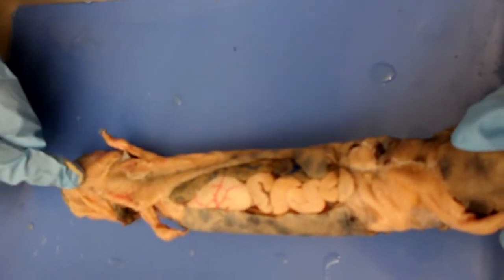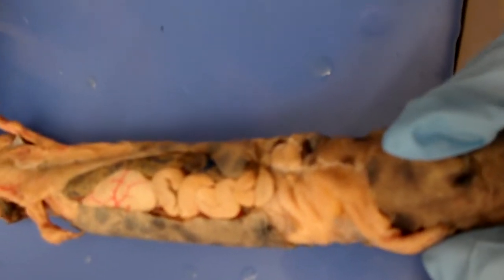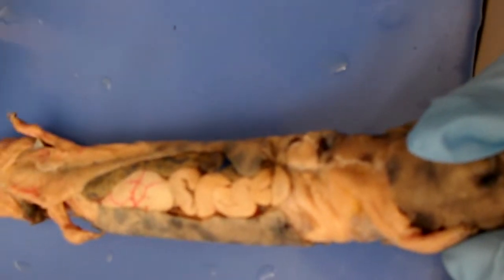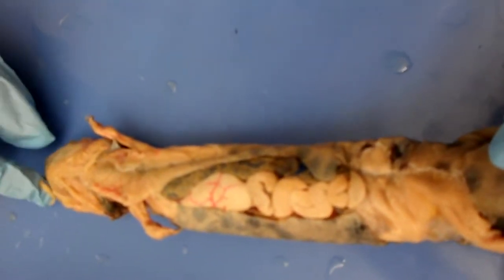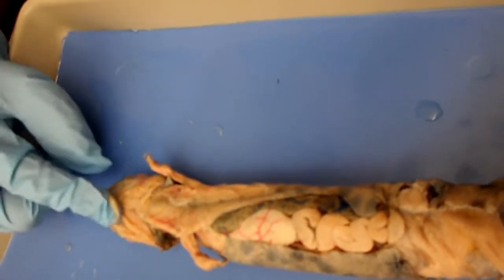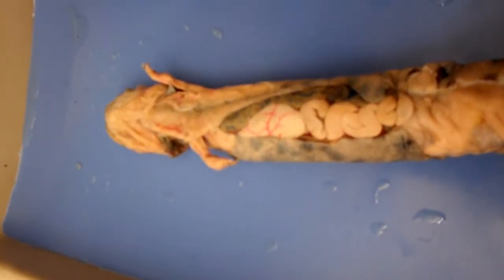These two little areas right here going down the middle are the geniohyoid. It originates at the mandible and inserts at the basibranchial cartilage. The intermandibularis is homologous to the intermandibularis of the shark. The interhyoideus is homologous to the interhyoideus of the shark.